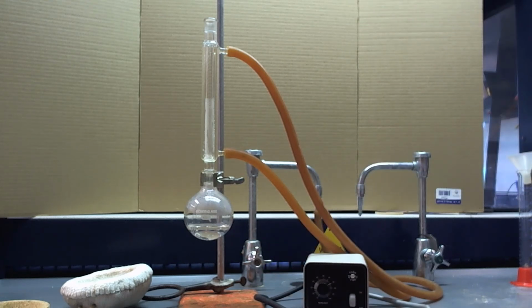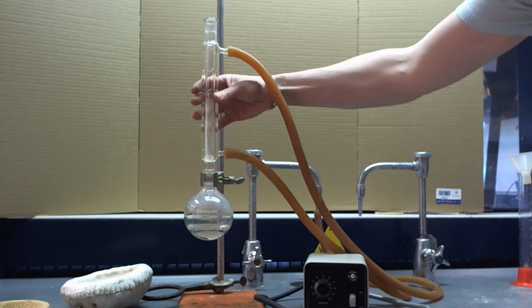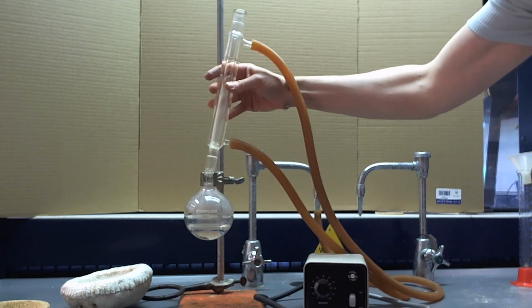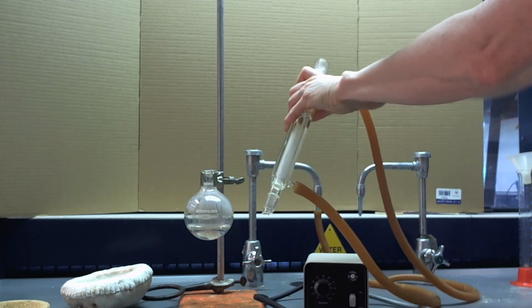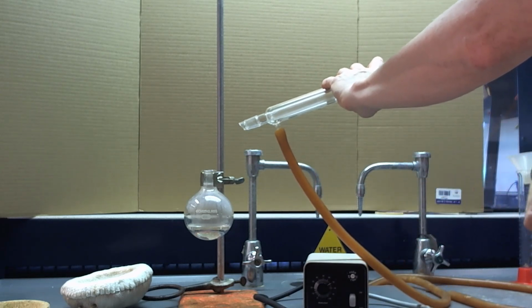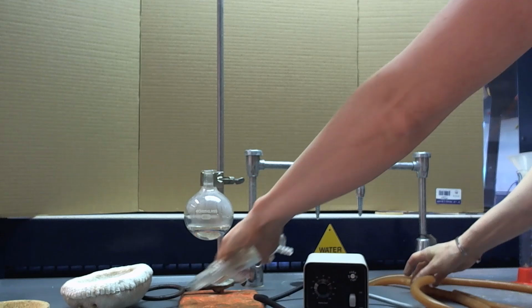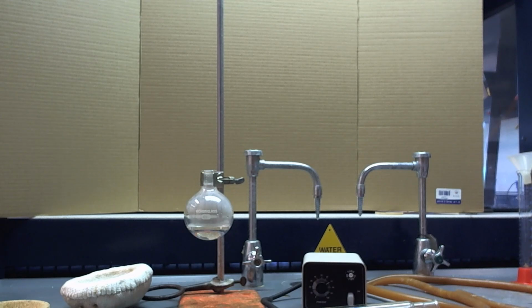Okay. And carefully start to disconnect things. Now the only piece of glass that is hot at this point is this flask, so you can leave that clamped. You can even take this reflux condenser off and then disconnect the tubes. Try to keep those tubes over the sink until you've drained out the reflux condenser. You can take that tube off and just set it down so I'll deal with it later. If this is hot, then you can let it cool and move on with the instructions in your protocol.